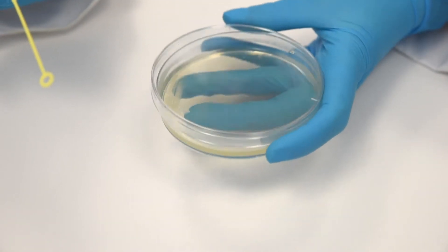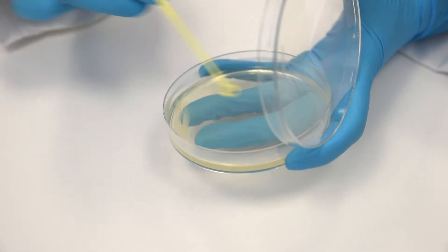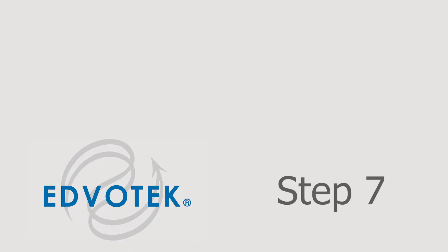Step 7: Cover the plate and incubate inverted at 37 degrees Celsius for 18 to 22 hours.